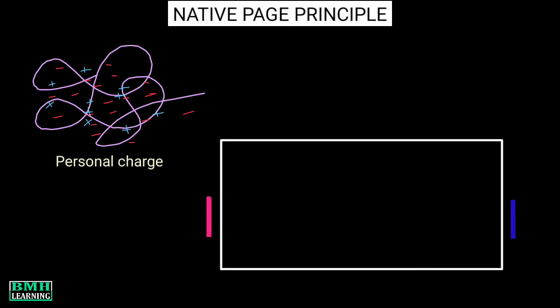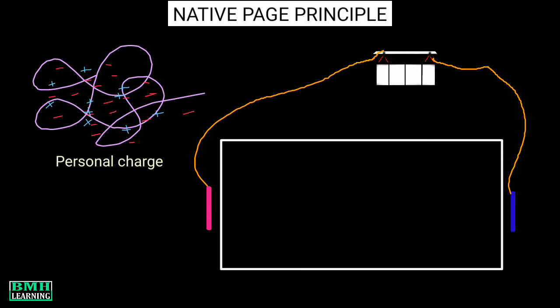So let's suppose we establish an electric field here. This side is positive, and the opposite to this one is negative. Let's say we are dealing with three types of native proteins differing in their molecular size, shape, and most important, they are having a different net charge. And remember, that different net charge is coming from the specific amino acid sequence a protein is possessing.